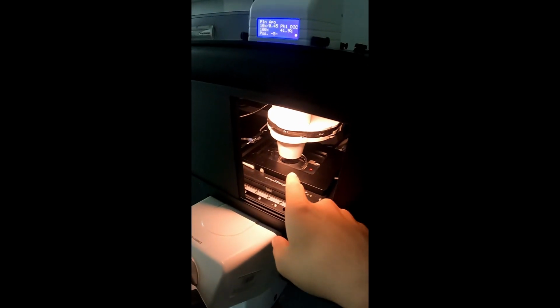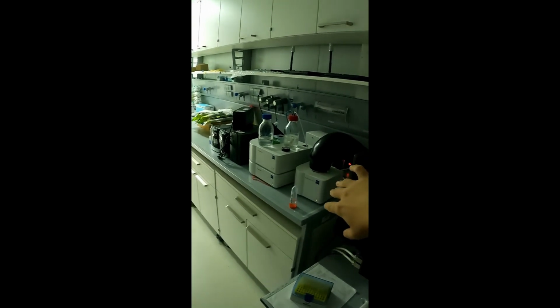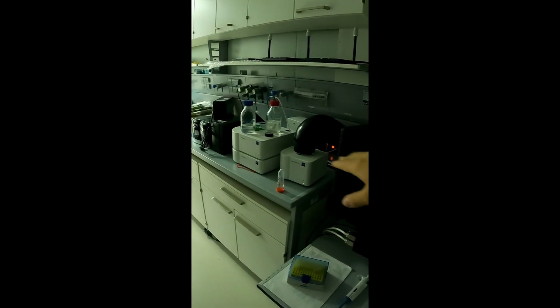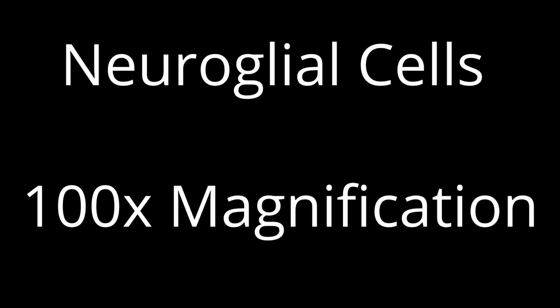Okay, this is Axio Observer 5 microscope. We're currently growing our cells. They are in that plate, the reddish one. And obviously cells need some environment, and this is provided in this chamber with these modules. For example, it's a temperature module that provides heat. Also, additionally, we have the humidity module. It has water, and also all the other gases from those valves, whatever we need, depending on what our cells might be requiring for their culturing.